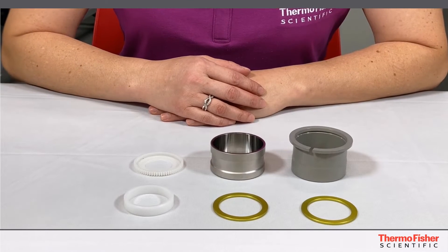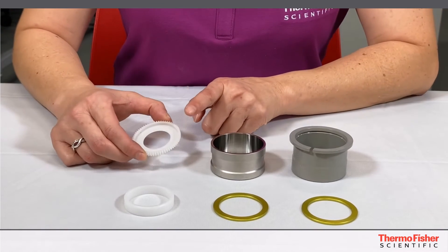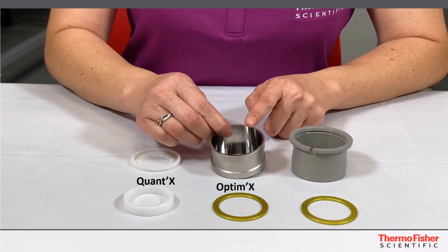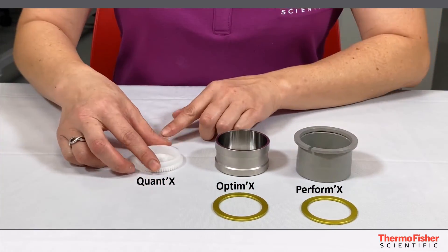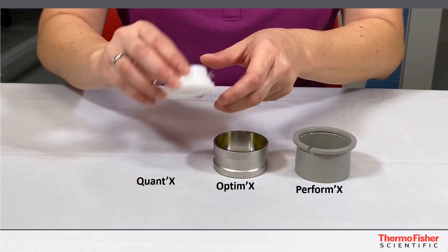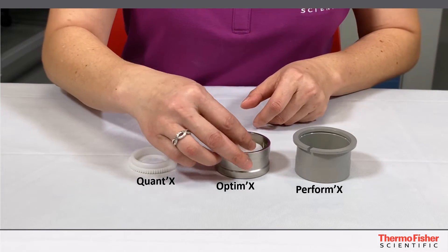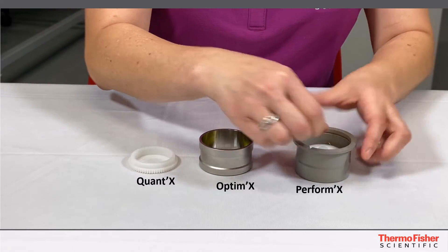Now the last thing to do is to put your prepped loose powder cup into the sample holder. We have here the Quantex, the Optimex cup, and the Performix cup. They all have individual centering rings, so I'm going to place them all in. Here is your Quantex, Optimex, and Performix.